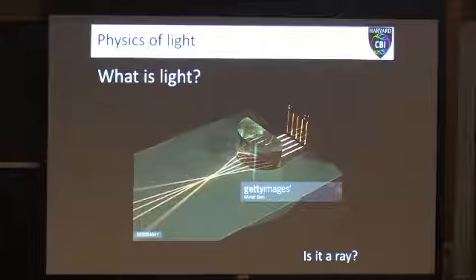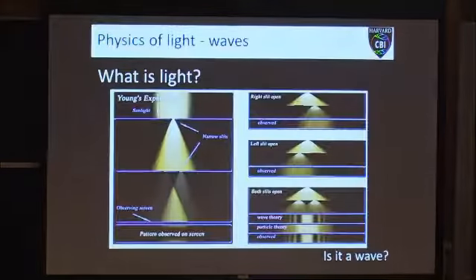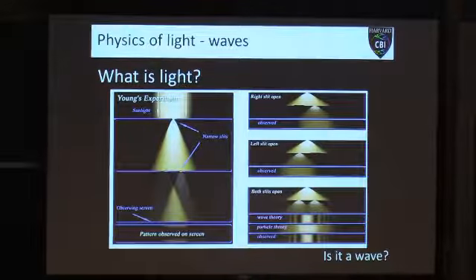So you went through a lens and then you could trace your rays and measure your angles and everything like that. And so in early high school, elementary school, we always described light as being a ray, moving as a particle. But the truth is that it's not. It has this weird duality in that it's partially a particle, a ray, and it's also partially a wave.